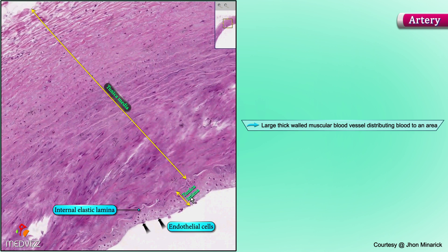In addition, if it is a very large artery, it may have more than just one band of elastic tissue. It may have other elastic fibers in it, like you see the lighter lines here and here. But notice that these elastic fibers do not extend the full thickness of the wall as they do in the aorta and the other classical elastic arteries.